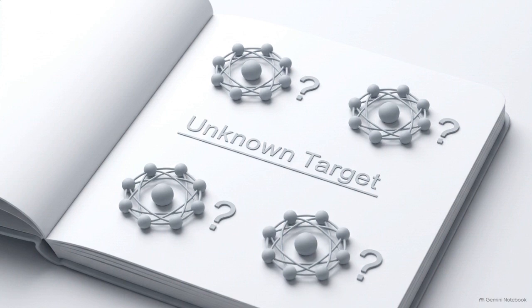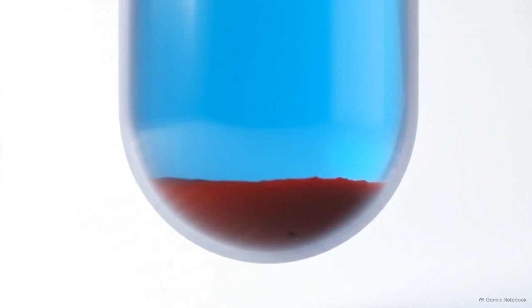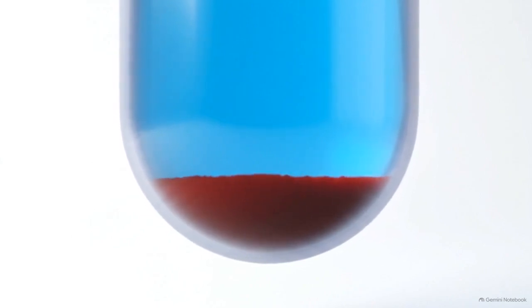To find its specific atomic arrangement, we have to look closer. We use Barfoed's test to separate single-ring monosaccharides from double-ring disaccharides. This test relies on the raw speed of the reaction. Our sample reacts in under 2 minutes. That rapid timing proves it is a stronger reducing agent, isolating it as a monosaccharide.